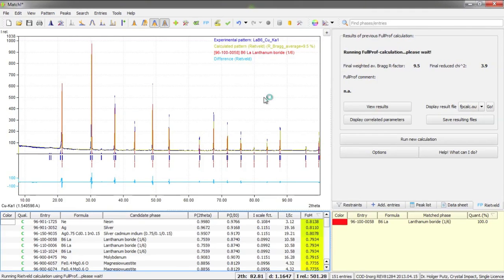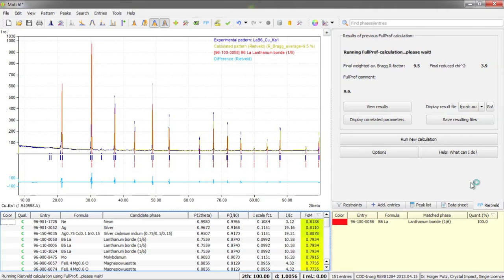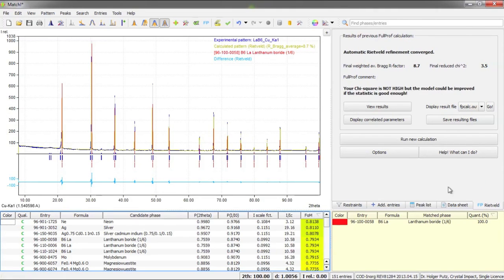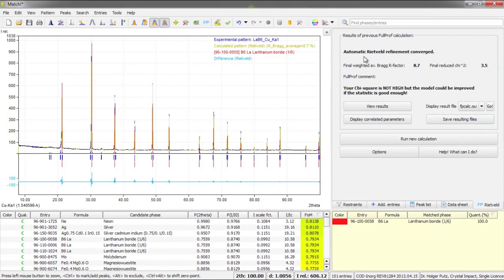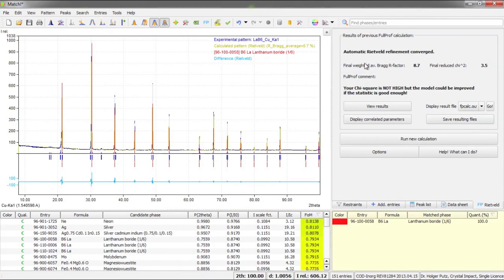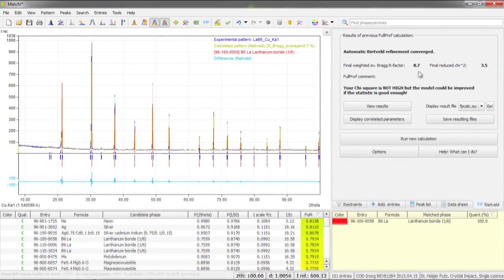In addition we have the Rietveld tab here on the upper right hand side being displayed instead of the normal restraints tab. Here we can see the status of the current calculation as well as some numerical indicators for the quality of the agreement between the experimental and the calculated diffraction pattern.